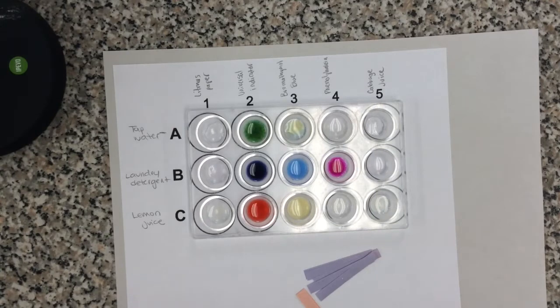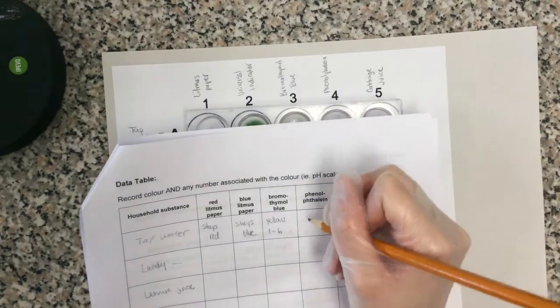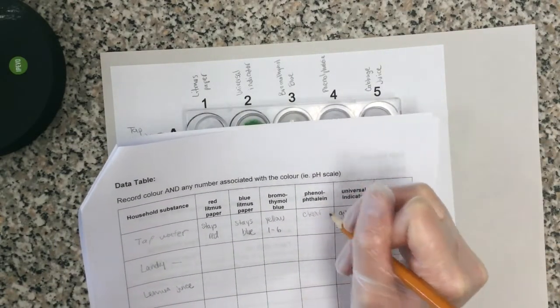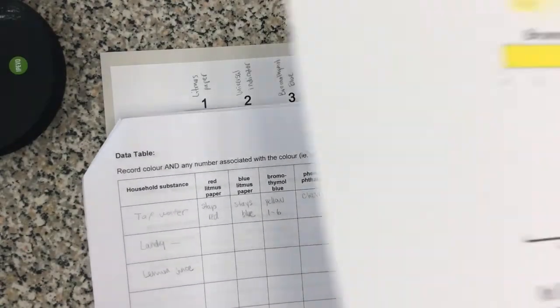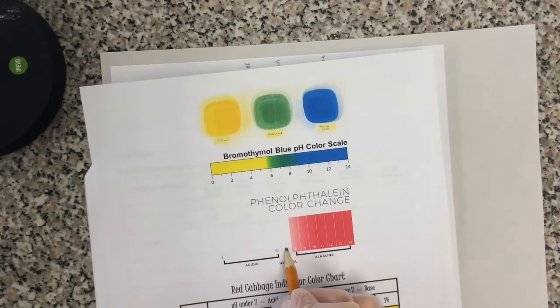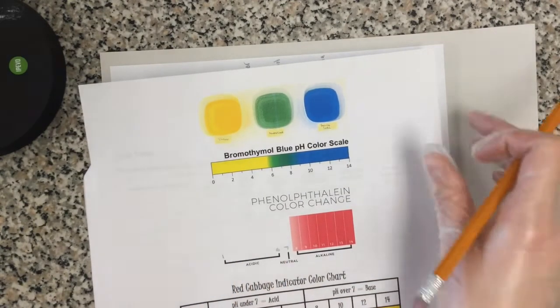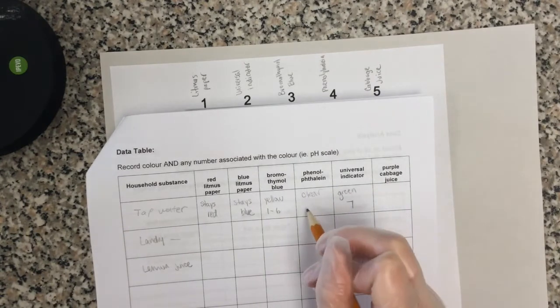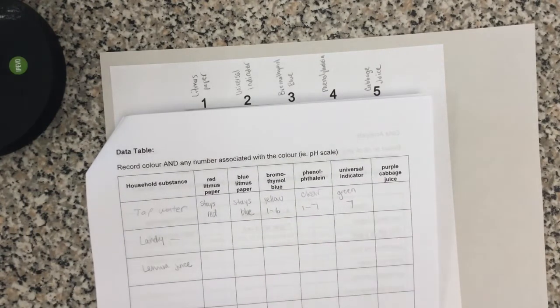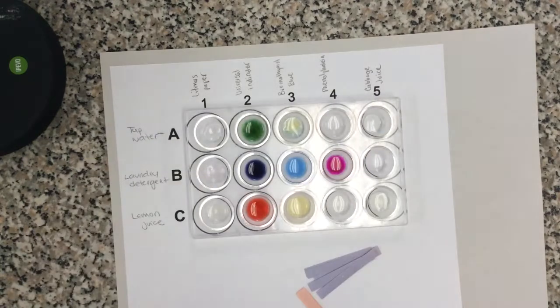Okay. So now I can go ahead and record that information in here. Tap water with phenolphthalein is clear. So when I look here at my chart, this is 1 to 6. We know that neutral is 7. So it's somewhere between the range of 1 to 7. Okay. Go ahead now and fill in your laundry detergent and your lemon juice.